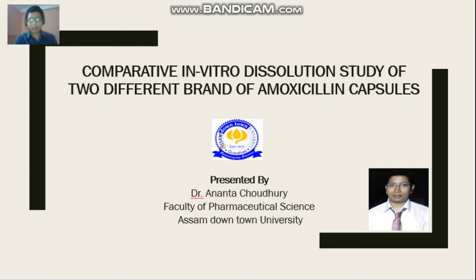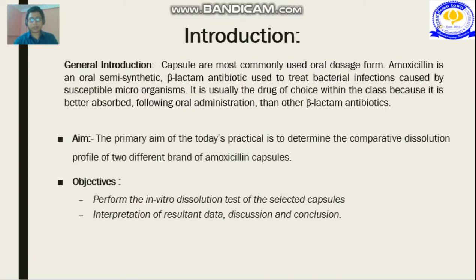Good morning all. Today we are going to perform the comparative in vitro dissolution study of two different brands of amoxicillin capsules. This particular practical has been divided into three different sections. First one is the introductory part, with a detailed discussion of the need of the practical. Next is the experimental part, where we will perform the demonstrations of the practical, and the last one is the conclusion part. Now let's see the introductory part of this practical.